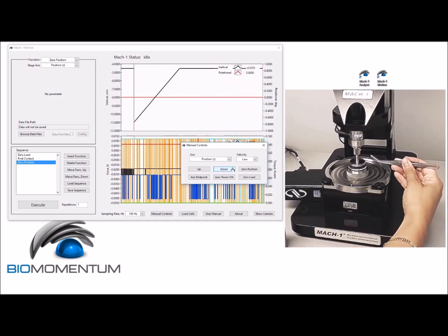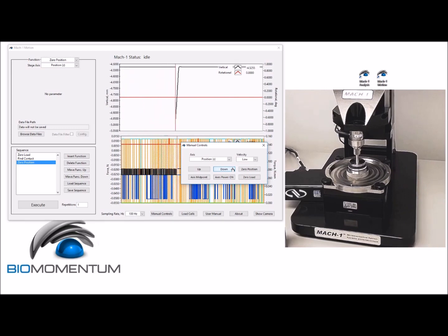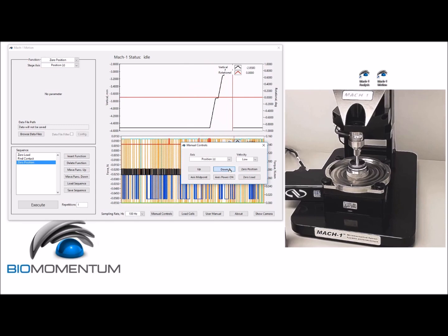The shaft of the indenter as the center axis. Make any adjustments as necessary by moving the sample, then perform the following test sequence to measure the disc thickness.